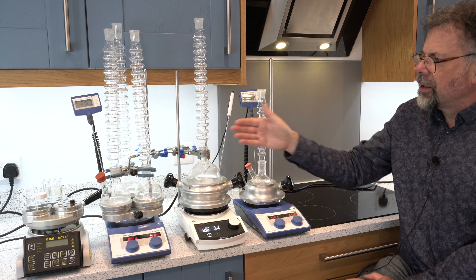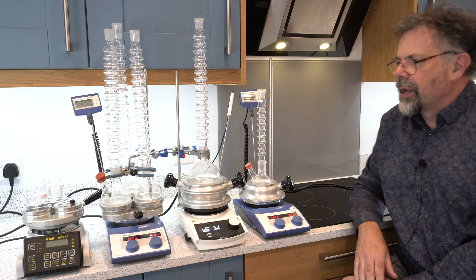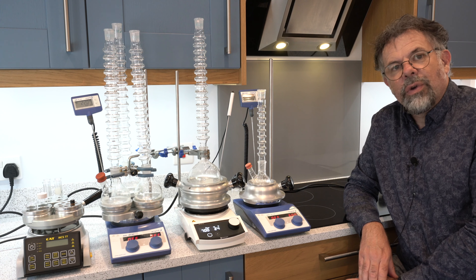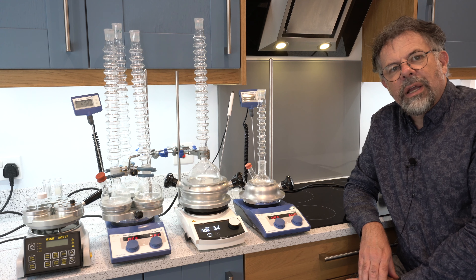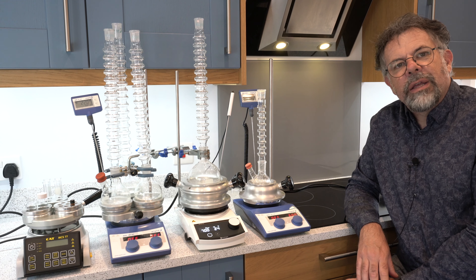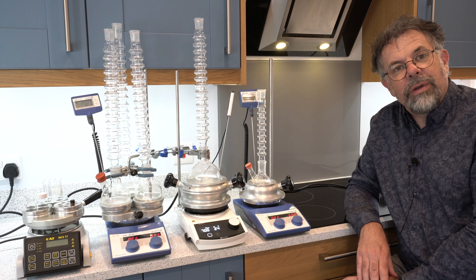As you can see here, I've also added onto the round bottom flasks our condensing waterless condensers, and again there's another video that can be linked to above where you can find out more about how they work.